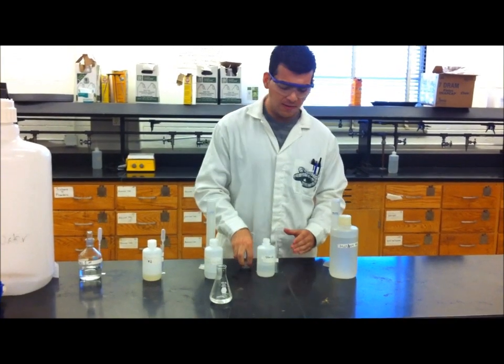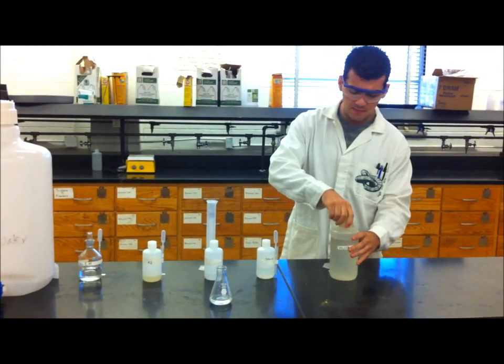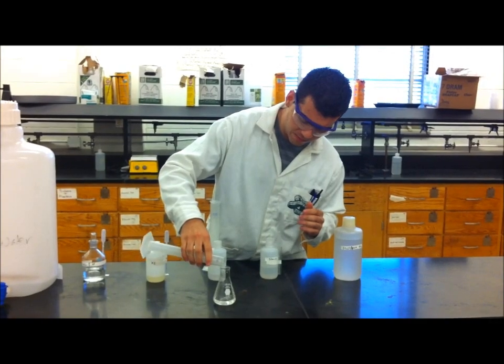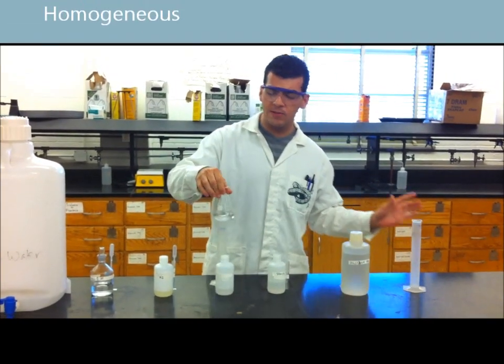Lastly you will need ten milliliters of hydrogen peroxide. This will initiate our reaction. Be sure to shake it to create a homogeneous mixture.